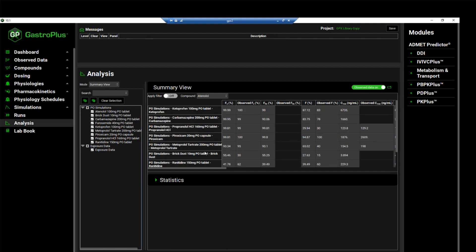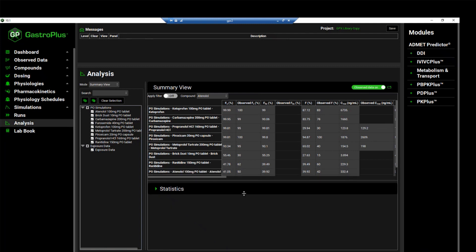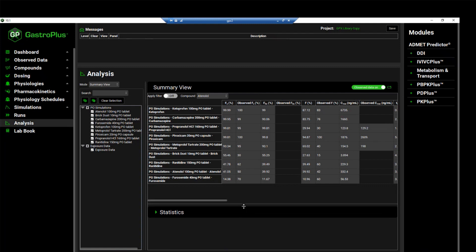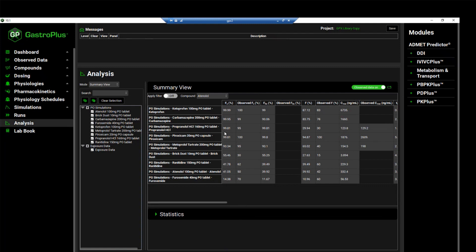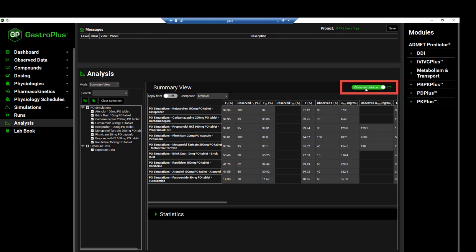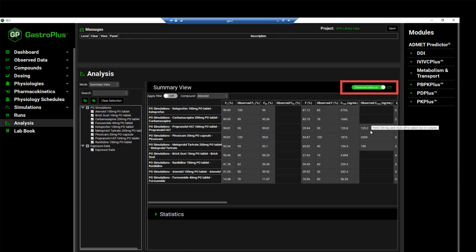As you can see, the simulations have been reordered, and we see that the ketoprofen simulation was the one with the highest fraction absorbed. We can expand this panel so we can see all the simulations included in this run. We can also unselect the observed data toggle so that we are not going to see the entries that we have for some of these simulations that have observed data.